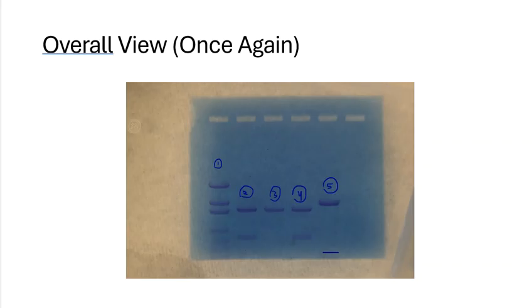So half comes from the mother, half comes from the father. In crime scene identification, we are trying to determine if that person was present at the scene of the crime, yes or no, which means that that person's DNA would be present at the scene of the crime, yes or no. So we are looking for perfect matches in these types of scenarios. And I think visually, by looking at the gel, you can quickly determine if those scenarios take place or not.